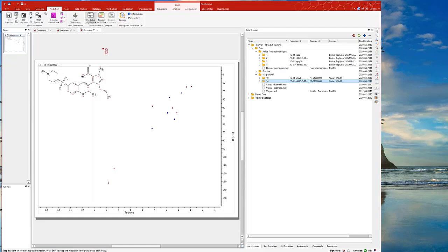Yes. So if I go to the prediction ribbon here, you can see there's a predict and verify only for HSQC. If you click there, you see there's an HSQC option. If you choose that, it's going to draw the rectangles showing the range of each HSQC peak from the structure. And it will color those rectangles based on whether there is an experimental peak picked within that rectangle.